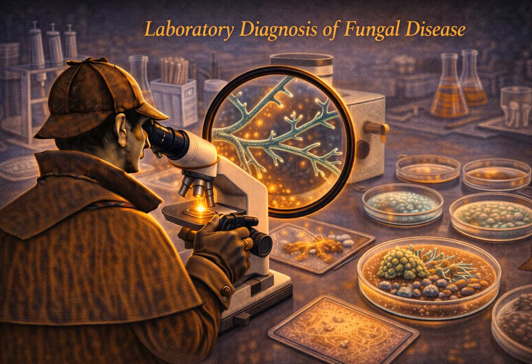But Murray mentions a caveat here. They aren't always pretty purple ovals. True. Sometimes, especially with older cells or different species like Cryptococcus, they just don't hold the stain well. They can look speckled or gram variable, or if the fungal cell wall is damaged, they might even look pink. But as a general rule, if you are thinking fungi on a gram stain, think purple.